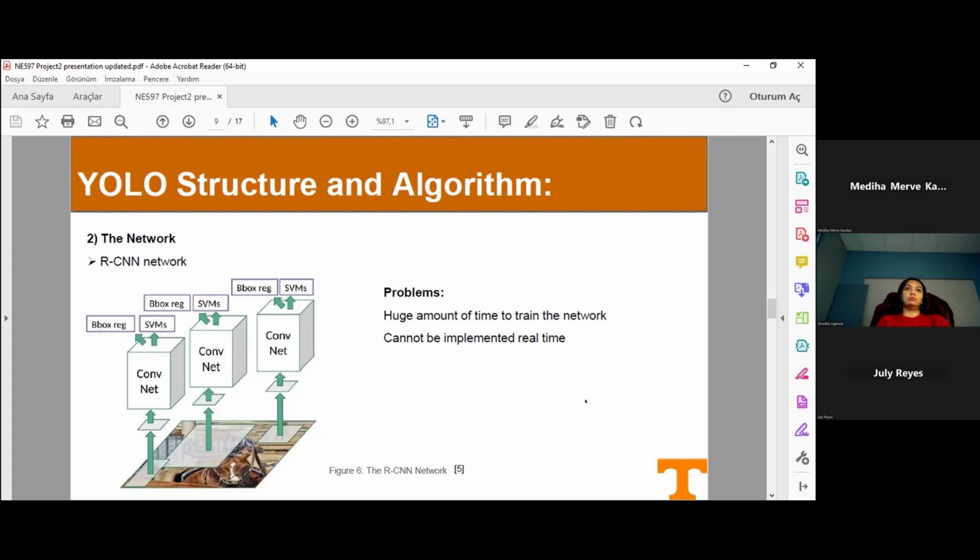What is the convolution layer used for? A convolution layer transforms the input image in order to extract features from it. In this transformation, the image is convolved with a kernel. A kernel is a small matrix, I mentioned in the former slide, with its height and width smaller than the image to be convolved. It's also known as a convolution matrix or convolution mask.